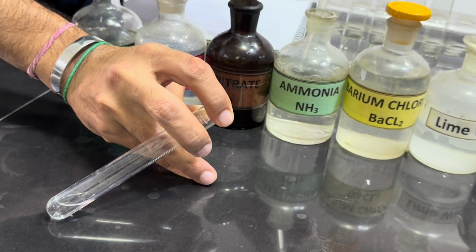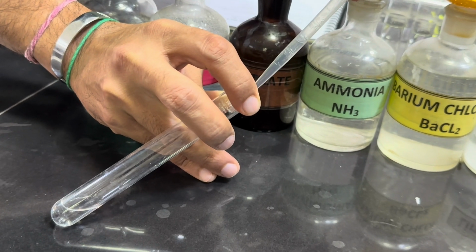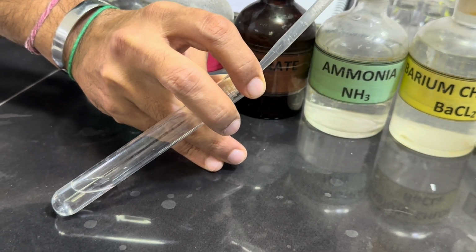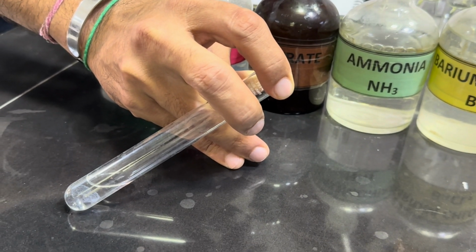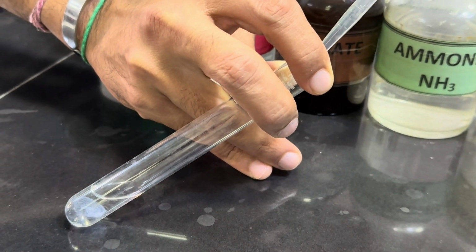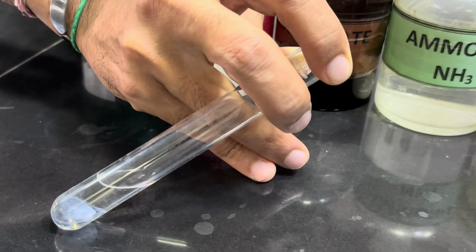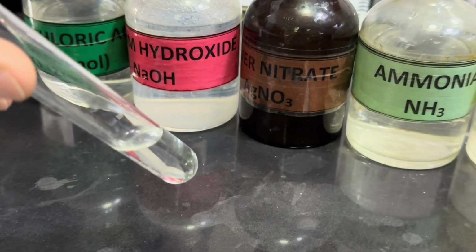So, adding dropwise. White precipitates are forming from the bottom, and now if we keep on adding, those white precipitates are dissolved.